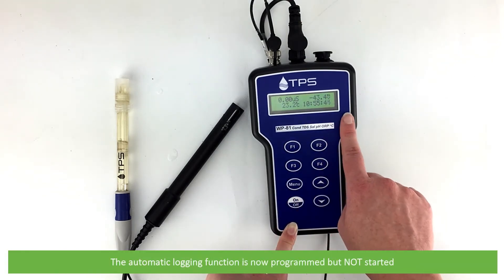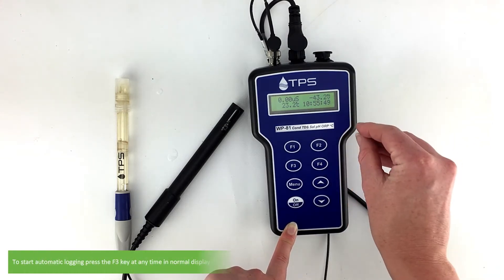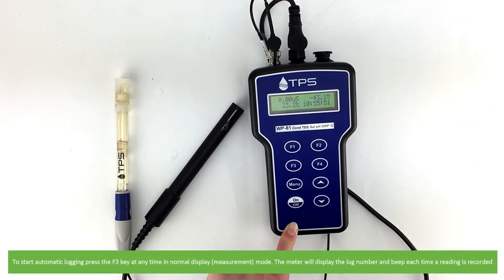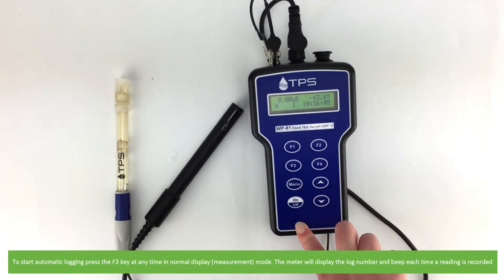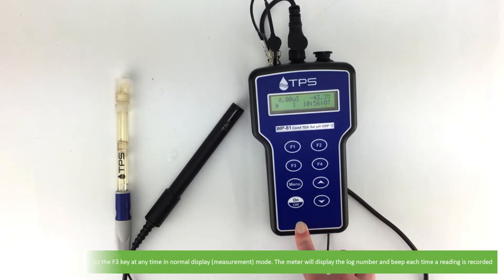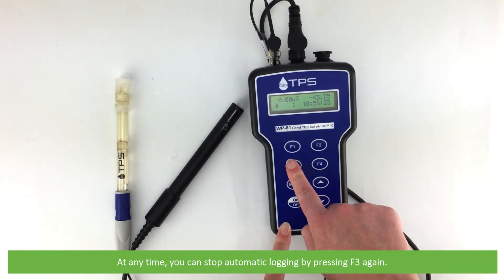The automatic logging function is now programmed but not started. To start automatic logging, press the F3 key at any time in the normal display mode. The meter will display the log number and beep each time a reading is recorded. The meter will continue logging. At any time, you can stop automatic logging by pressing F3 again.